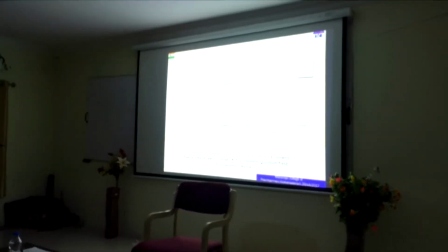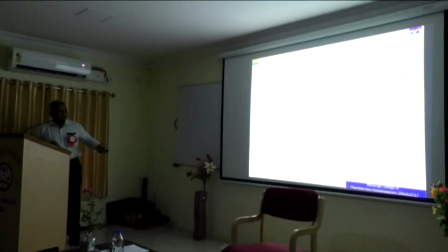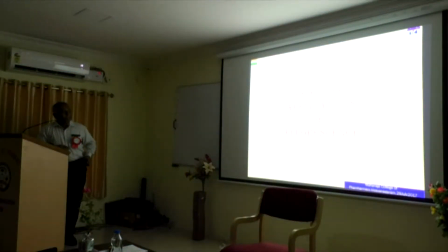So these are the few inferences which we wrote down, and then we say that fluorescence lifetime, quantum yield, polarity, all these things will contribute to the nature of the excited state, which we can find out and say it is more polar. Next slide.